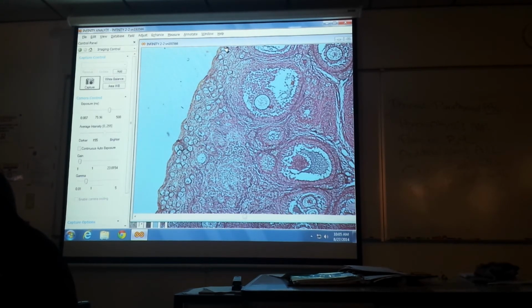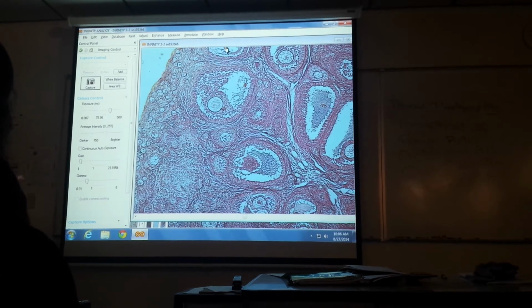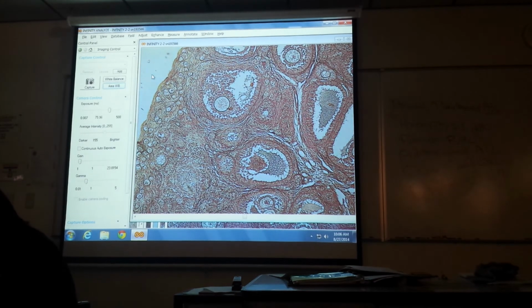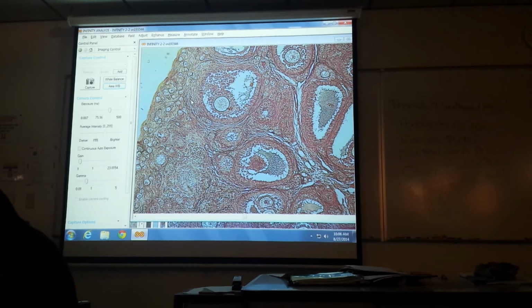Are granulosa cells on the study guide for ovary, or is it just theca? Okay, theca, we'll just do that then. Well, this one's pretty good to look at, theca. Theca actually secretes the androgen, the hormone that's converted to estrogen. So that's why I wanted you to note it. It's that fibrous tissue right there. Let me put it under high mag. It's a fibrous looking tissue.